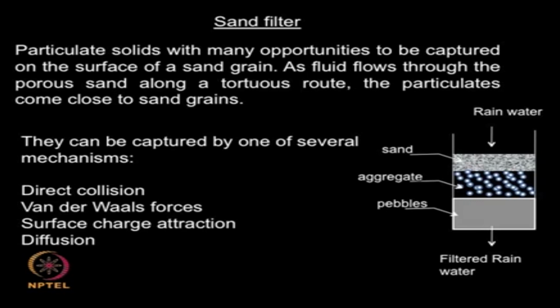They are very useful and simple, very cheap, and once you set up this type of filtration assembly, it can last for many years. As long as the percentage of solids present in your slurry is minimal, these depth filters are extremely advantageous, and the operating cost is practically zero.